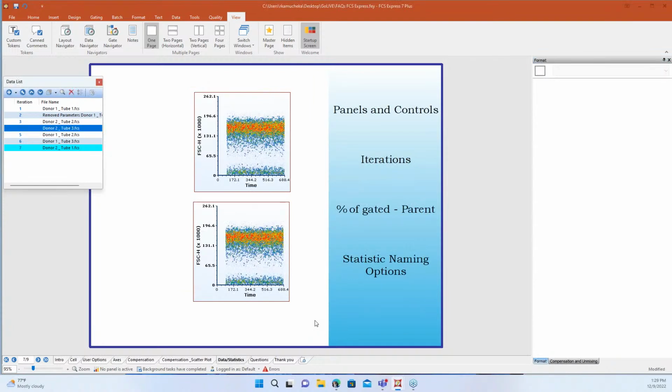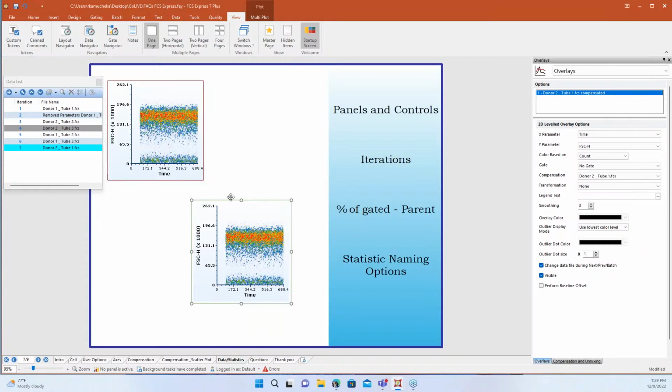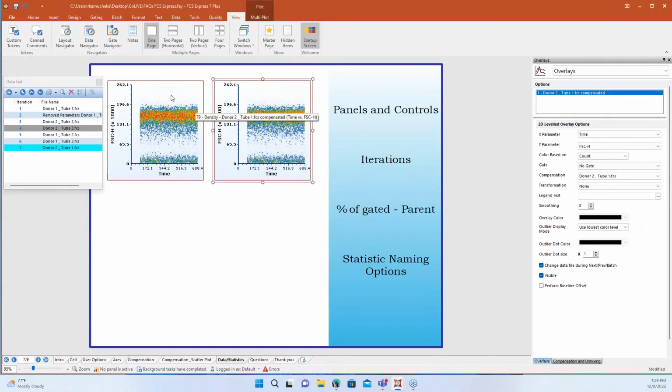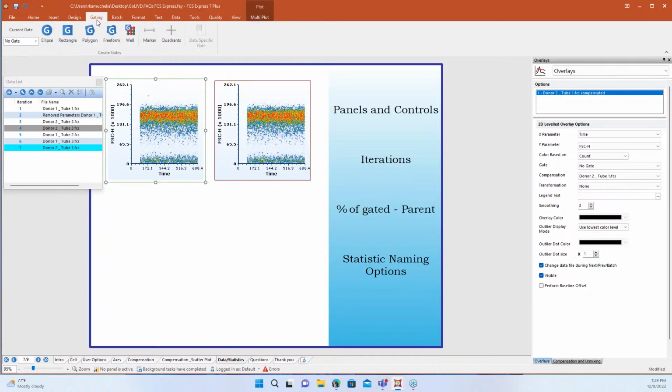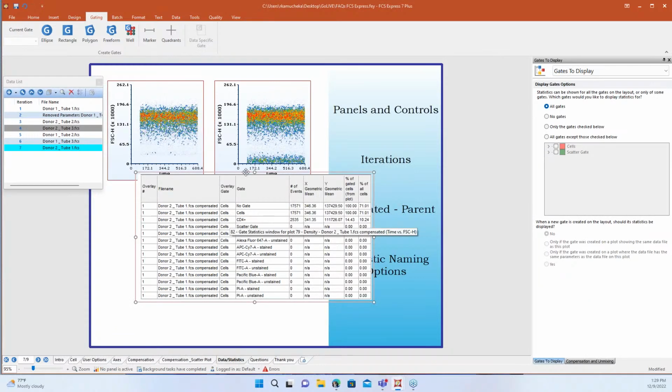Now, another question that I've seen twice this week, I don't know if it's just statistics week, is about percent of gated. So FCS Express does handle statistics a little bit differently. Whenever we display a population or a gate on a given plot, so if I go here to my gating tab and throw on my cells gate, for instance, if I create other gates downstream, when I right click to do gate statistics, I will see the relationship.